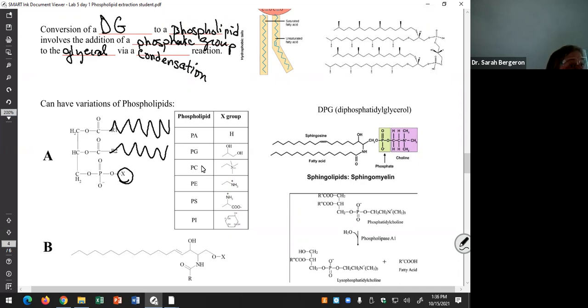Yes. For this next experiment, I'm not going to tell you what your percentages should be. You are going to run the experiment and find out for chicken hearts what the percent of each of these phospholipids is. Then, instead of doing calculations and additional problems, you're going to go into the literature and find some citations where they actually talk about cardiac lipid composition. What's each percent? Now, are you necessarily going to find chicken? Maybe not. What might you find?